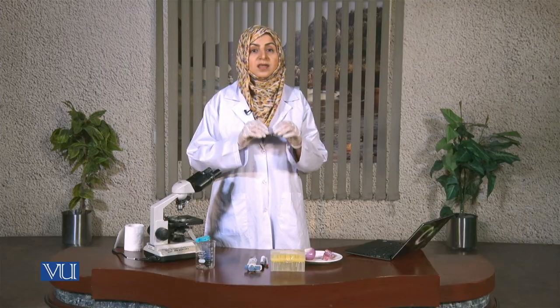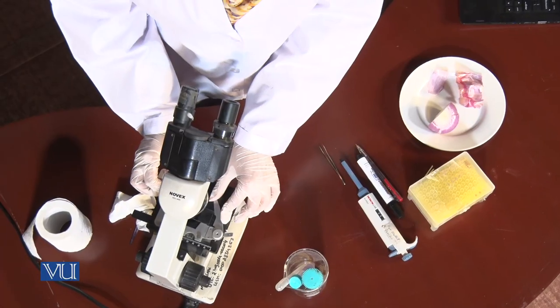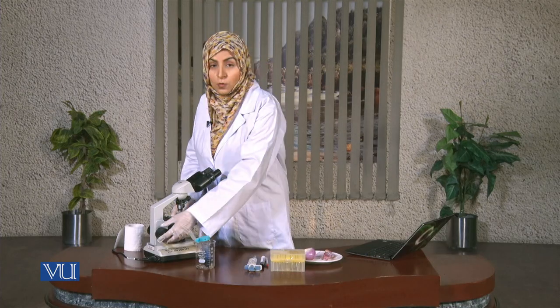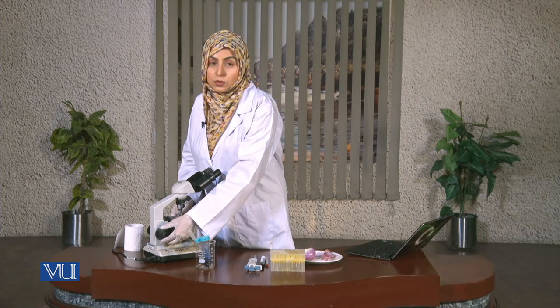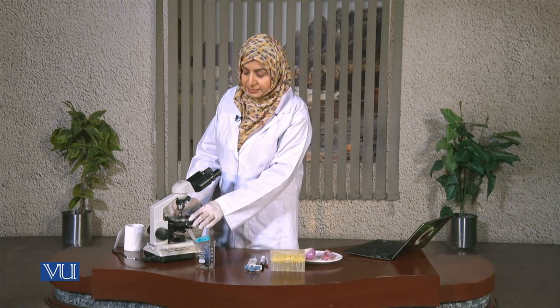Now we have to talk about the mistakes or errors that students can make while making the experiment for the very first time. You should not have wrinkles in the onion epidermis while putting it on the slide. You should know how to use a compound microscope — how to focus the lenses, how the coarse focus and fine focus work, how to put the slide on the stage, and how to identify the cells.